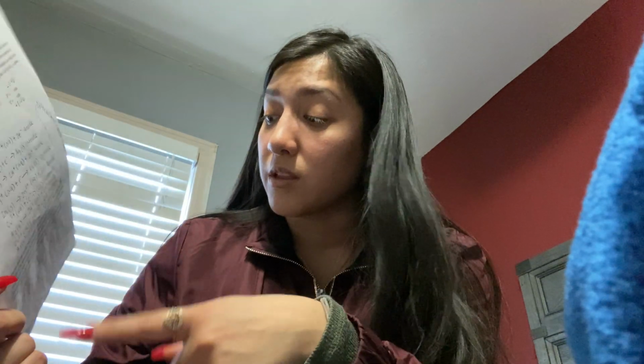And yeah, because in the data table it made us pick the certain cells and then the metals and then the chemical solutions that turned them to the left or to the right. And then mostly all were from right to left for the electrons, and the voltage, if it went from left to right, was a negative number, and if it went right to left, it was always a positive number. We also wrote down the 6 combinations of the tables needed for the chemical equations to know which direction it needed in volts and then the electrodes.